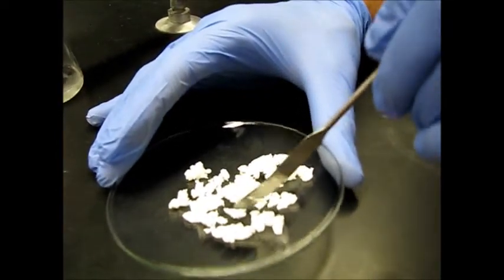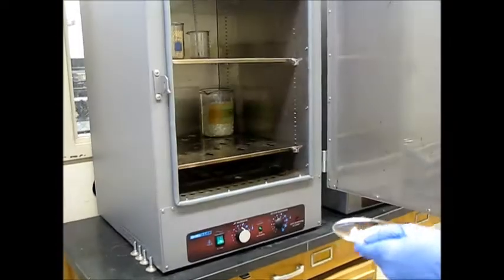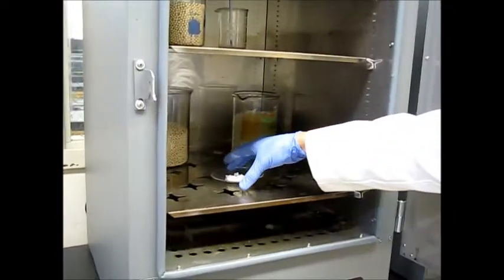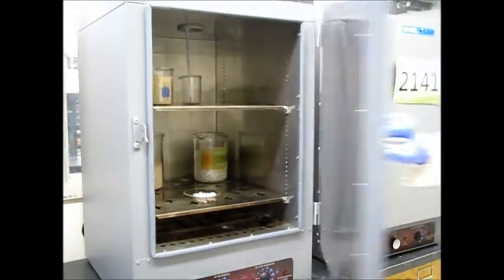So we'll leave this in the oven for about 10 minutes or so. We're just going to place our product right here in this bottom row. Leave it there for about 10 minutes and we'll come back and check on it and get a good mass.